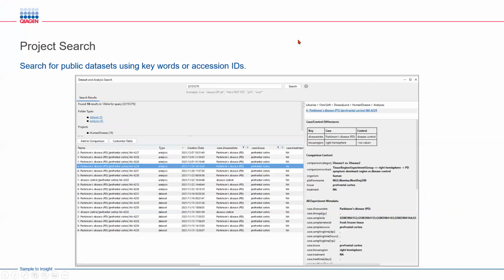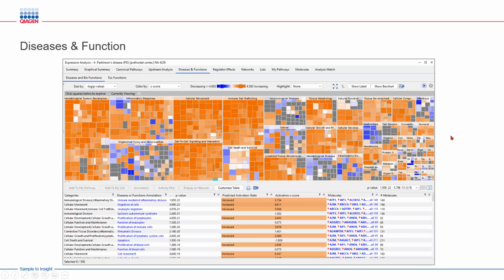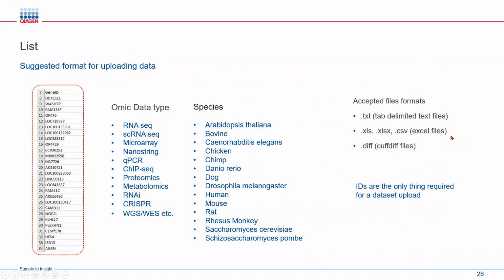All right. So we are moving to our last hour, and we'll look into how to basically process your own data. So far, we looked at how to leverage IPA when you don't have any data and you want to just look at public data information and just utilize it for your research. Now we have a scenario where we want to publish our own data. We want to analyze our own data. So let's take a look at this particular scenario.